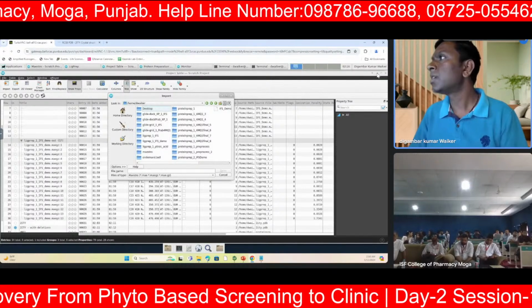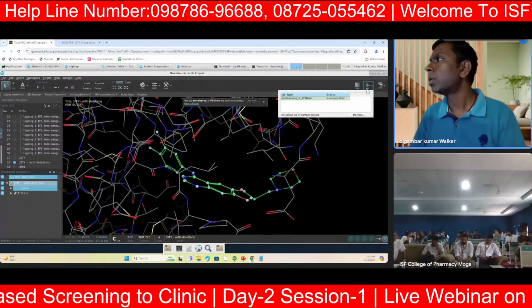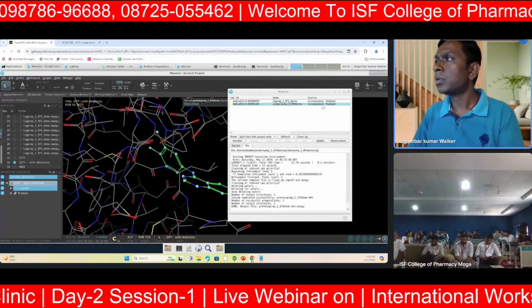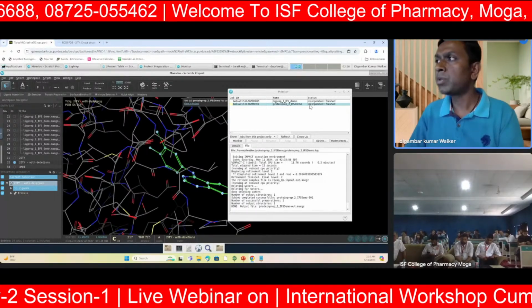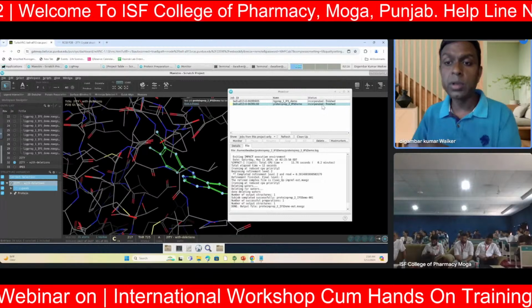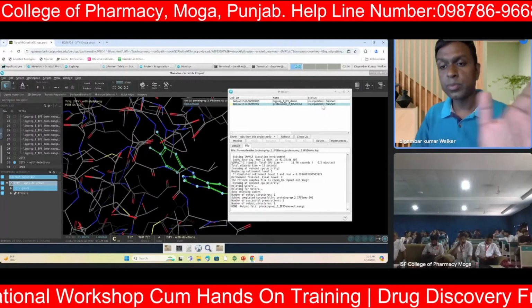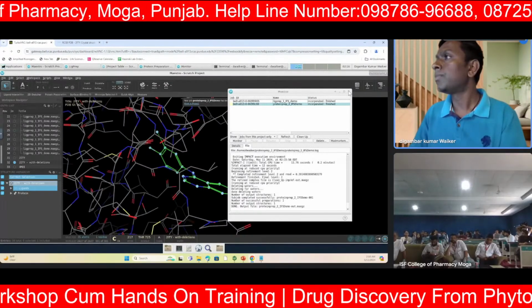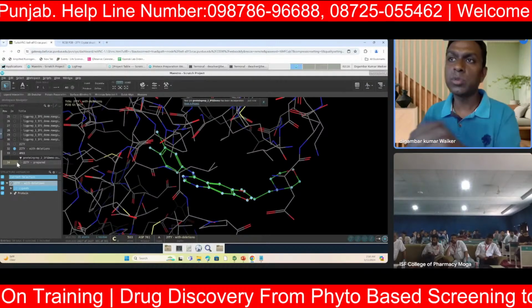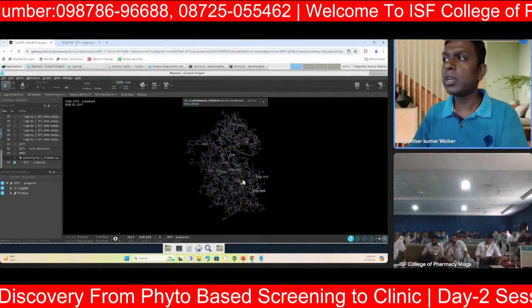Okay, now see, it is done. Here you will see it is done, incorporated, finished. Make sure that once it shows this message, incorporated and finished, only then can you import that prepared protein from your directory. Otherwise, until then you are not supposed to open that file. Once you have your protein prepared, it will also come into your project table automatically. Here you can just click on that and you can see.